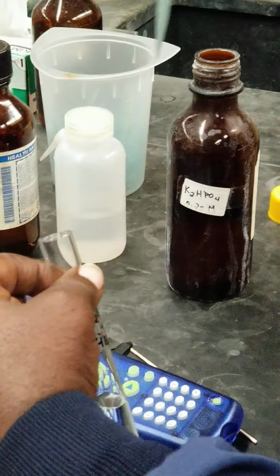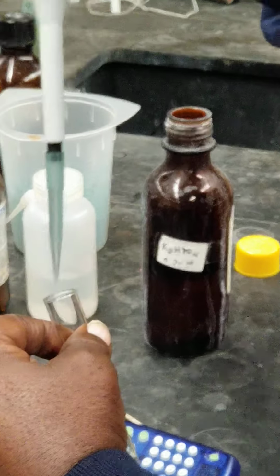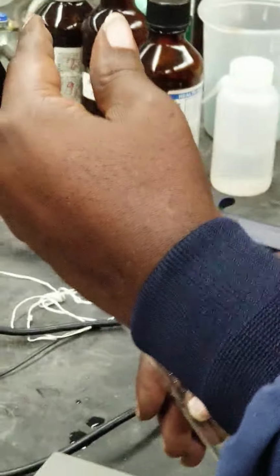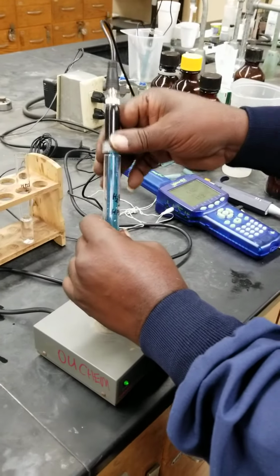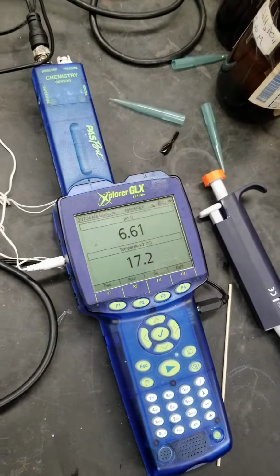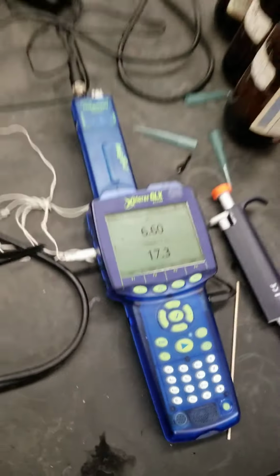Two. Three. pH is, let's read that as 6.60.